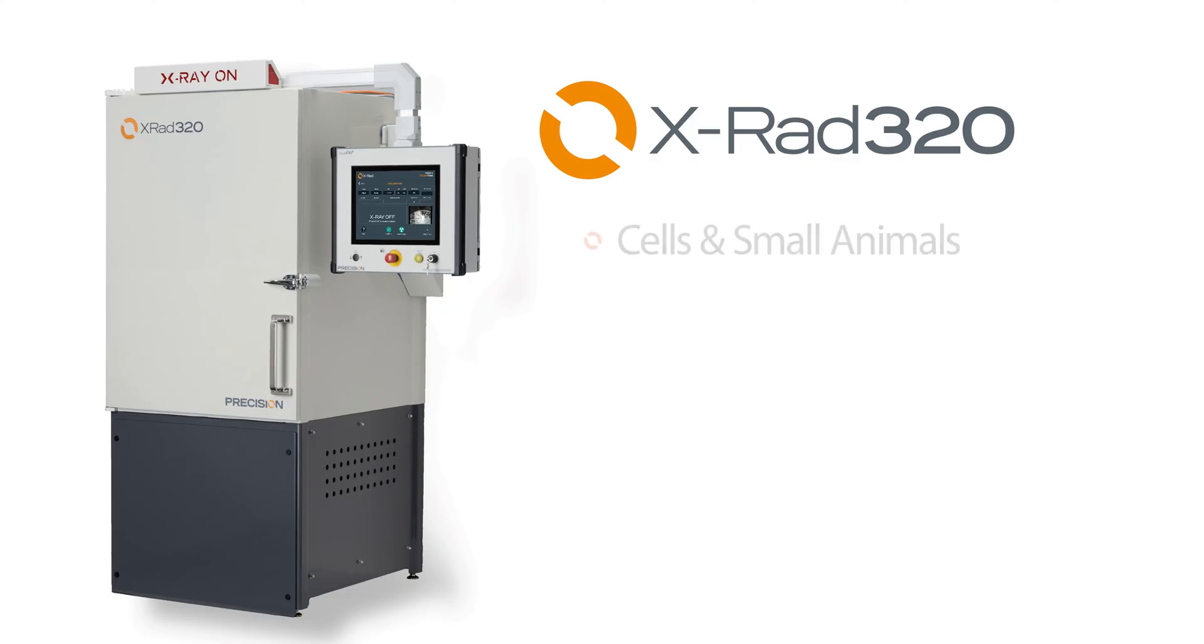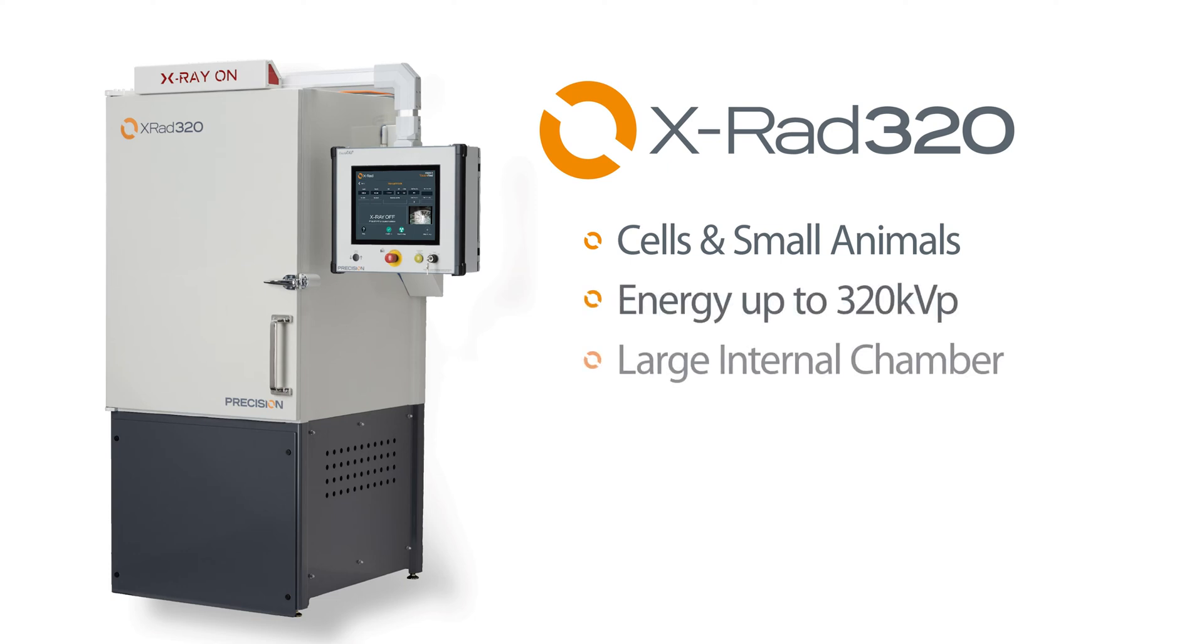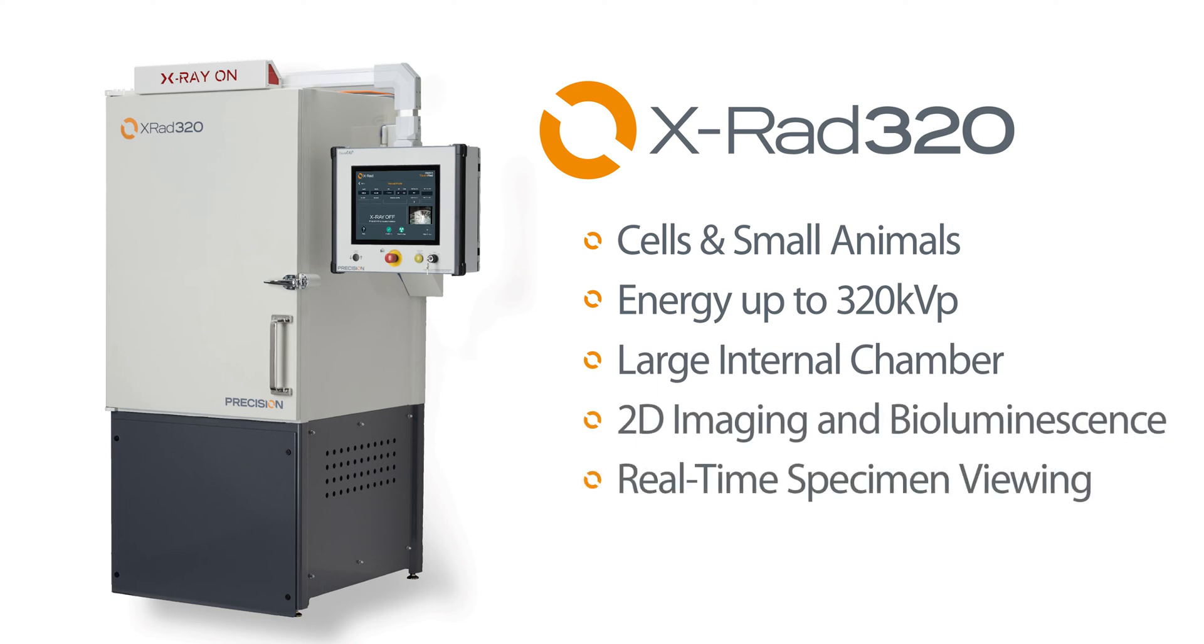From cells to small animals, the X-RAD 320 delivers a precise radiation dose with energy up to 320 kV. The large internal chamber increases throughput of cell plates, tissue samples, and small animals, while the small footprint conserves precious lab space.